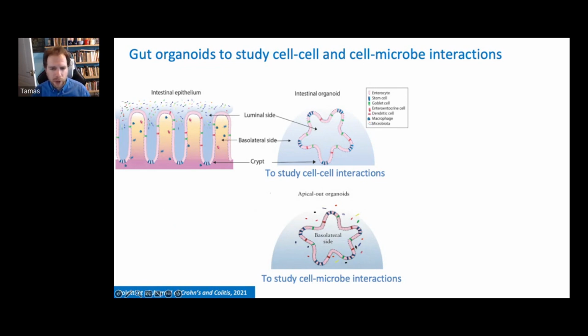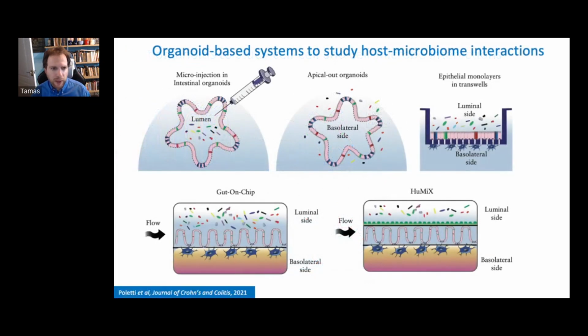Co-culturing bacteria with organoids is still challenging, mostly because of the aerobic condition that organoids like, and many bacteria don't. But it's still a good first approach. And then there are more complex ones. I already mentioned the apical-out organoid one. Then there is the micro-injection option for a normal organoid, which could work, but requires infrastructure. Sometimes it can actually be high throughput, but still there are certain cases when it's not the best way to do that. What is more trending is working with monolayers, basically disrupting your 3D organoid and creating a 2D layer from them. And that works really well in many cases.